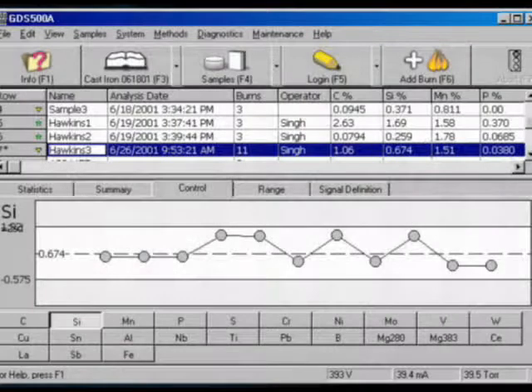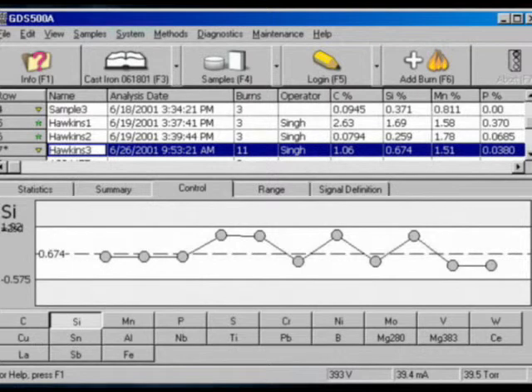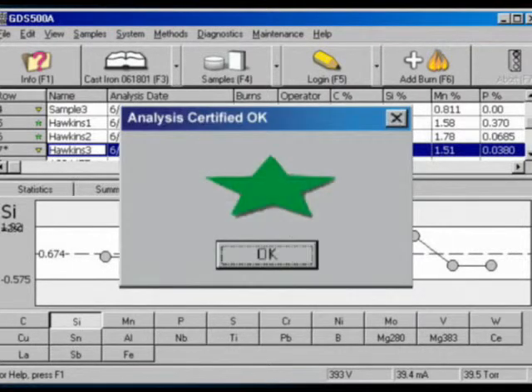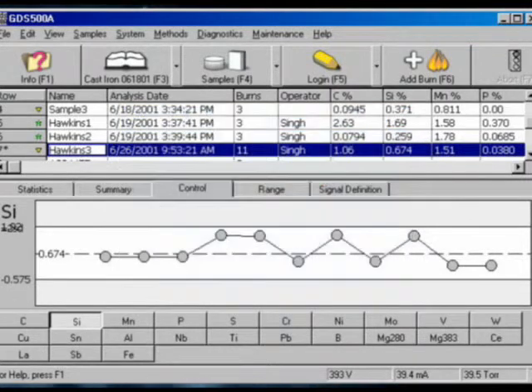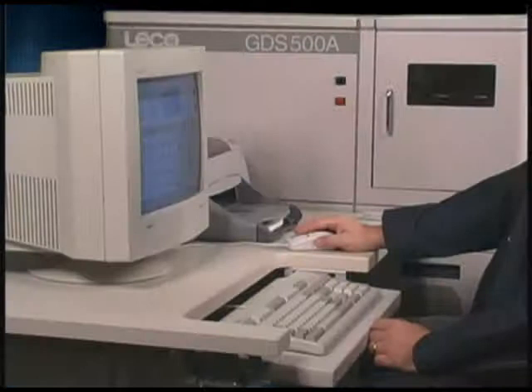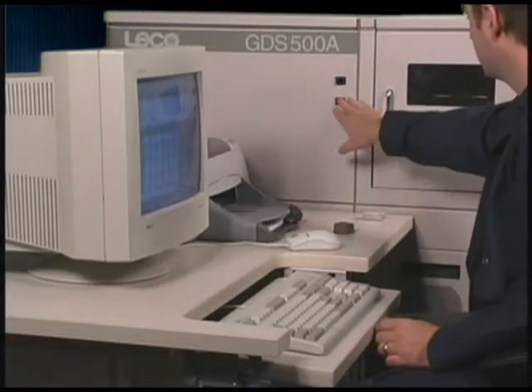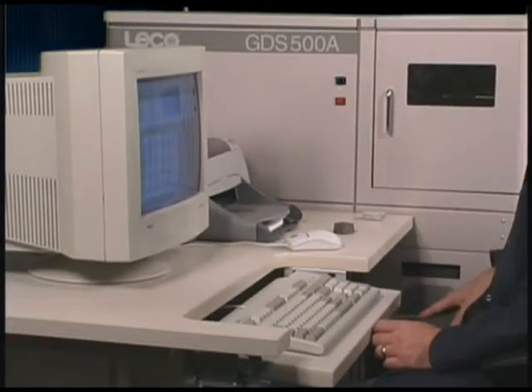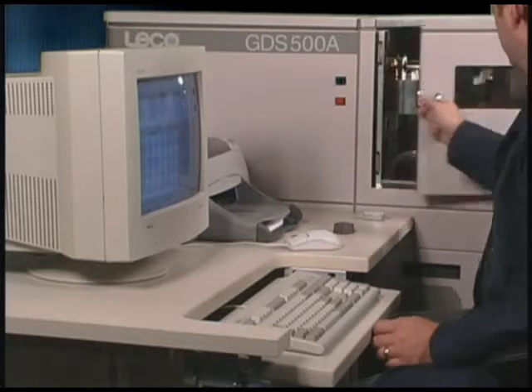Every sample analysis is checked against a set of customer-defined ranges and conditions. If the sample meets these conditions, it is given a green star to indicate to the operator that the analysis was error-free and correct. To begin another analysis, the operator simply removes the previous sample and the automatic cleaning cycle starts. After the cleaning cycle, the operator can then load the next sample to start the next analysis.